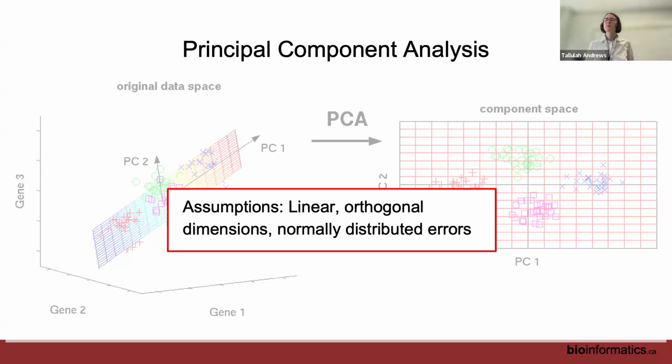And one of the things that I actually recommend doing, especially with things like highly variable gene selection, is that if there are certain genes or processes that you're particularly interested in, check whether they're in your highly variable gene list. And if they're not there, add them to make sure you're keeping all of those genes that you're interested in.